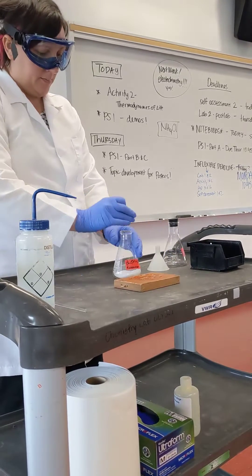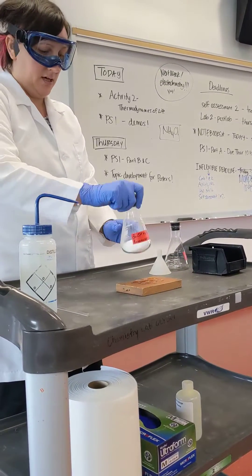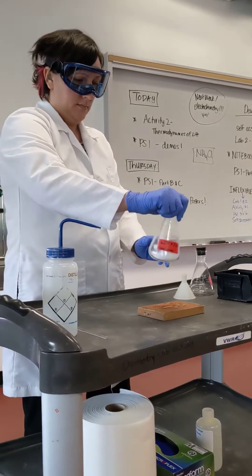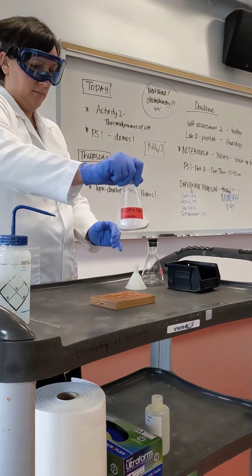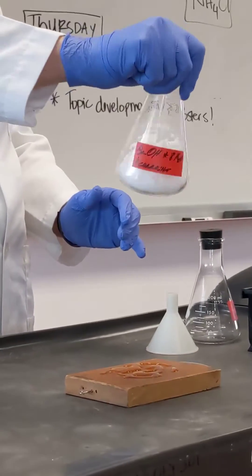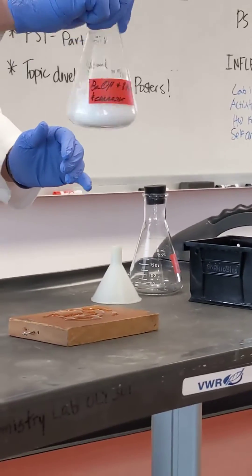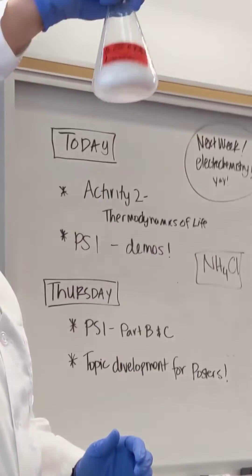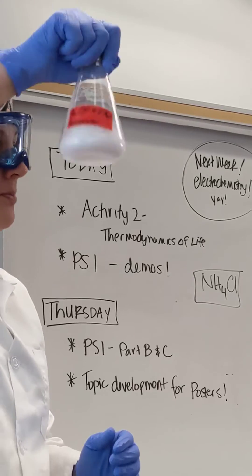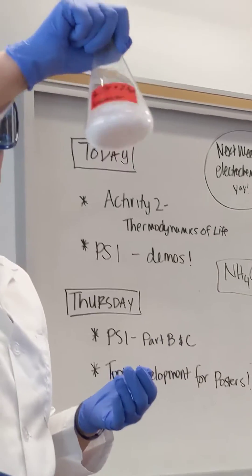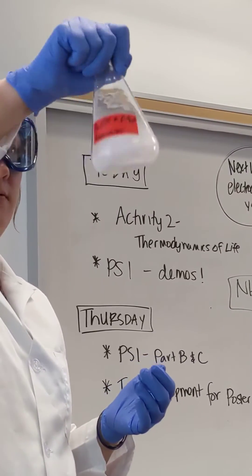Shake vigorously until the powders become liquid, but sometimes you've got to... This one is kinetically less favorable than the thiocyanate, which will happen faster.